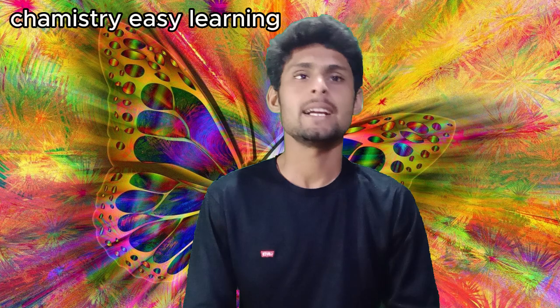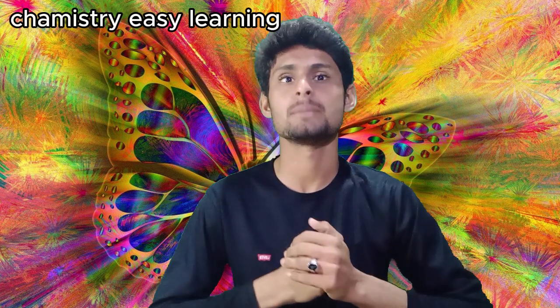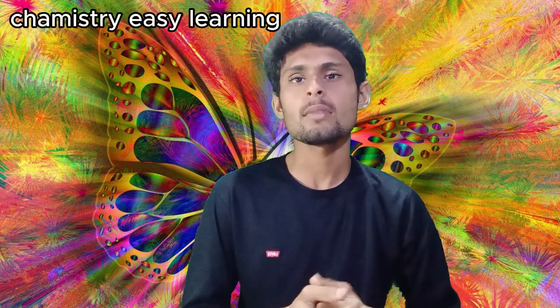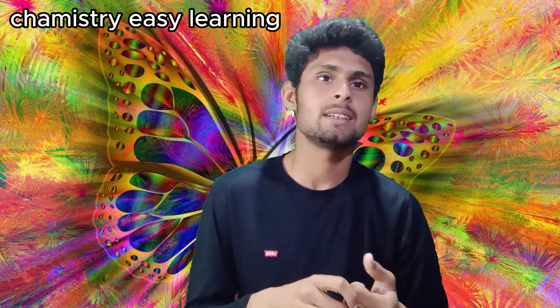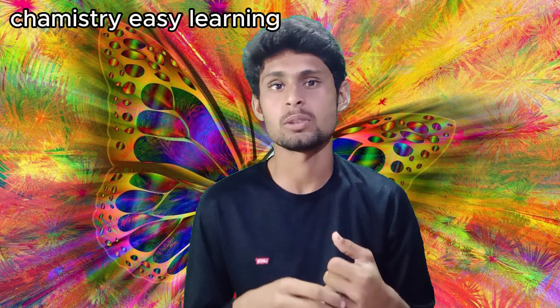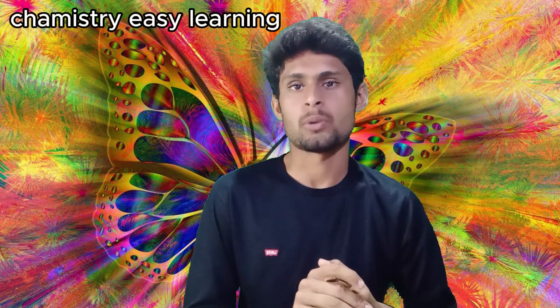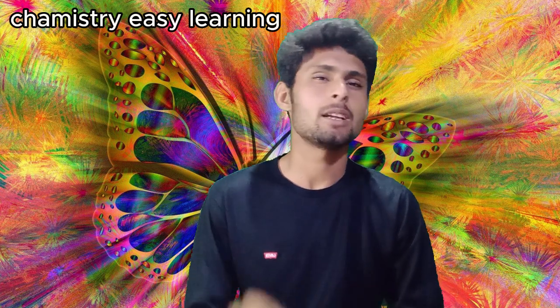For example, it is capable of separating all the components of a multi-component chemical mixture without requiring extensive foreknowledge of their identity, number, or relative amount of the substances present. It is versatile in that it can deal with molecular species ranging in size from giant protein molecules composed of millions of atoms to the smallest of all molecules, hydrogen, which contains only two. Furthermore, it can be used with a large or a small amount of material.